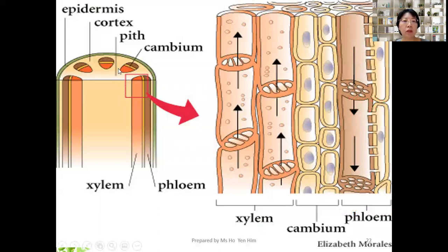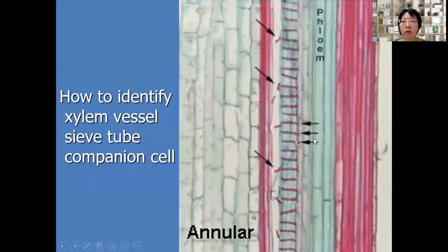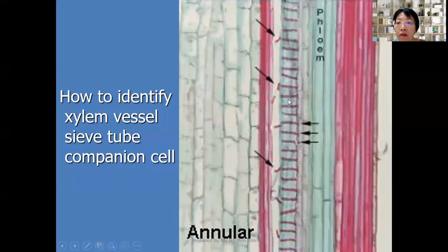We have seen the transverse section of the vascular bundle. In longitudinal section, all the cells will look elongated. In the center of the vascular bundle facing the center of the stem is the xylem, so you can see the xylem elements. Then you can see the cambium, and here are the sieve tube elements and companion cells. In this actual micrograph, the xylem vessel has lignin thickening, the phloem region contains the sieve tube, this is sclerenchyma, and these are parenchyma cells.